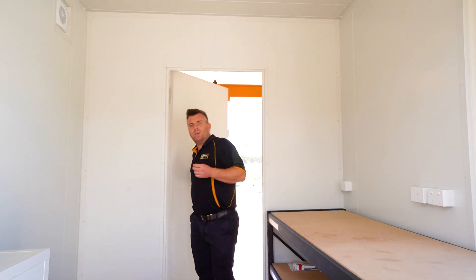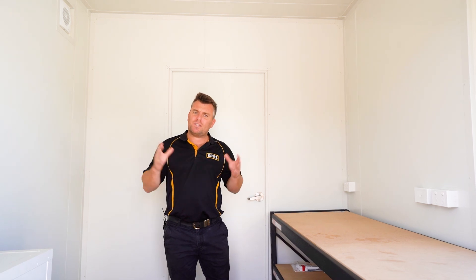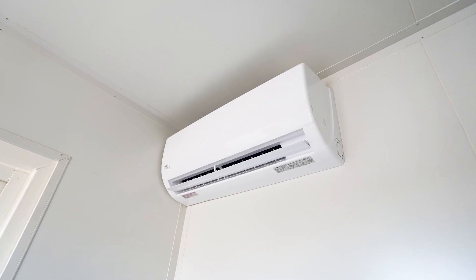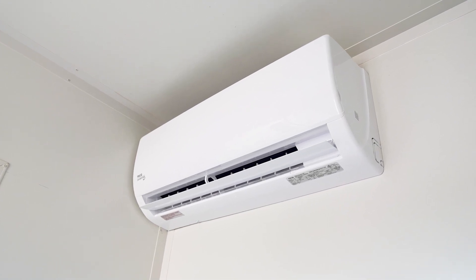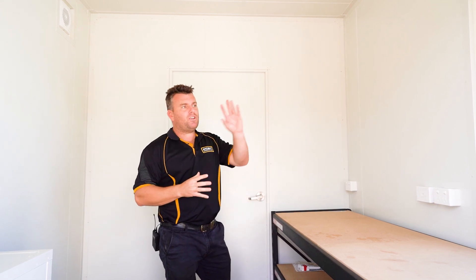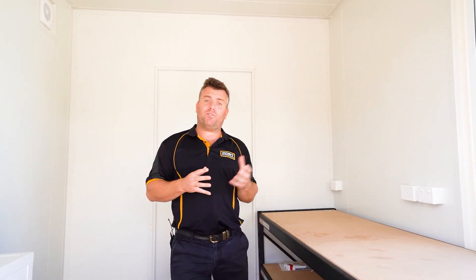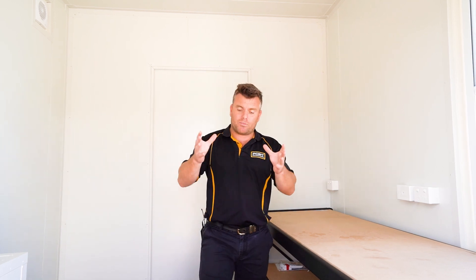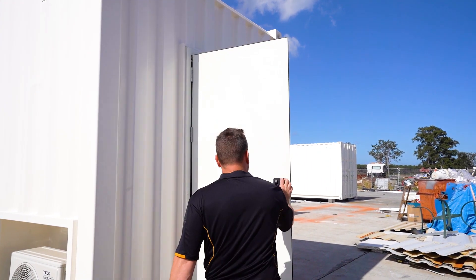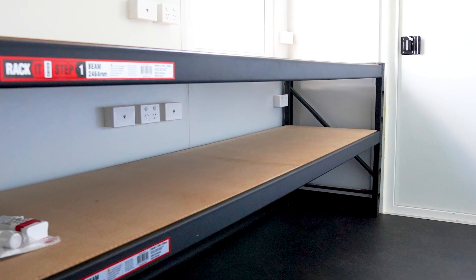Once we've got our oil sample we can take it through to our lab area here. This is a simple little space — it's fully insulated with an AC built-in as well as a small extraction fan. On this side we've got a heavy duty workbench and a nice simple window with a built-in shutter, just to allow some natural light and control the amount of sun. Coming through here we've got another exit point which is our personal access door, and underneath you'll see plenty of power options to power any analyzing equipment we might need in the field.